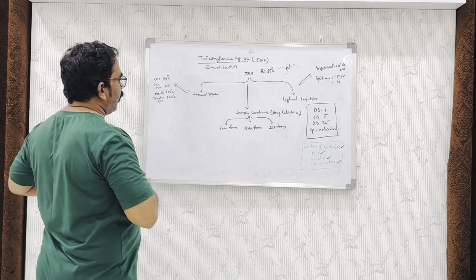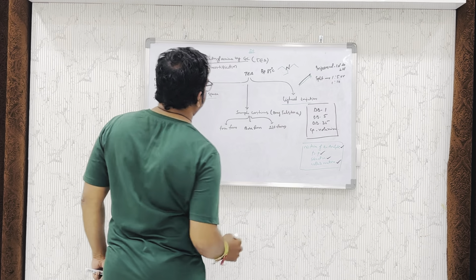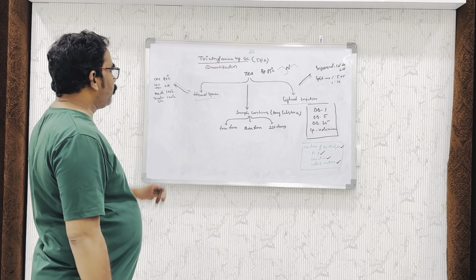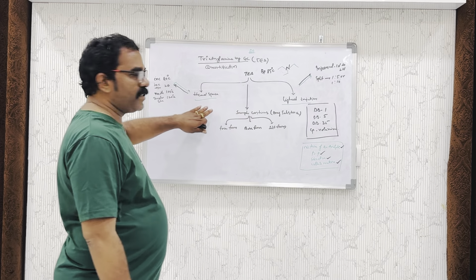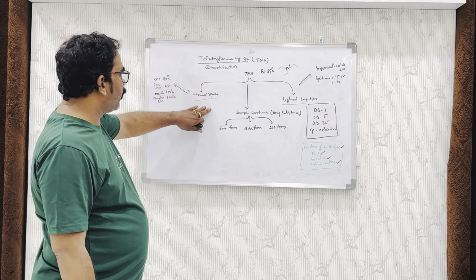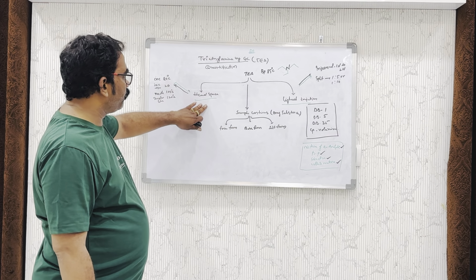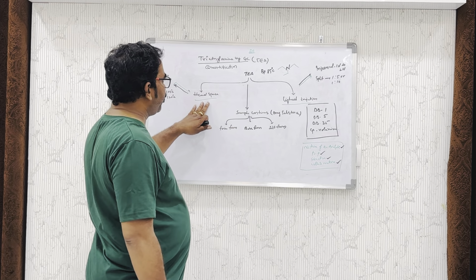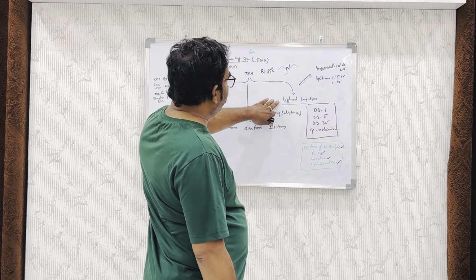For quantification, these two techniques we can utilize by gas chromatography. One is headspace, one is liquid injection. When can we analyze by headspace, and when by liquid? First, we give preference to headspace. It will come very easily, and we can get a good response also. And if any difficulty is there with headspace, then we can go to liquid injection.